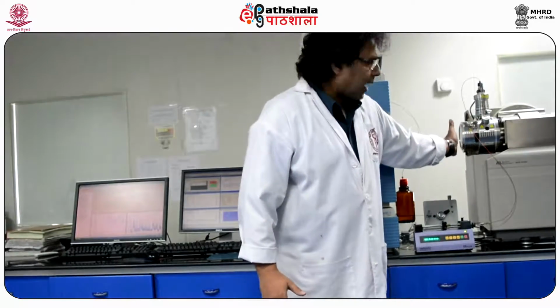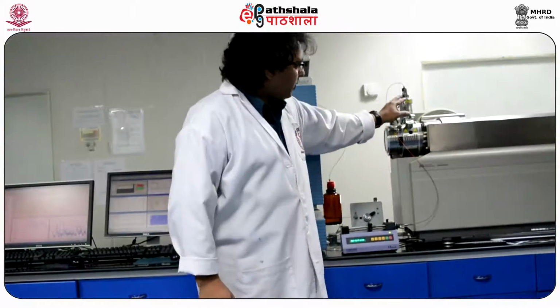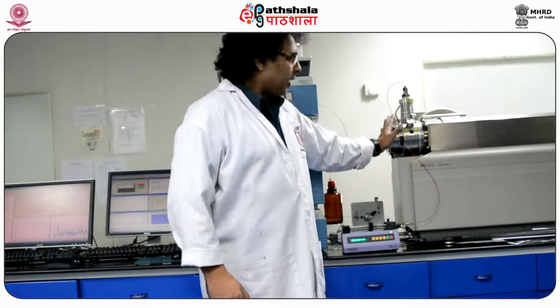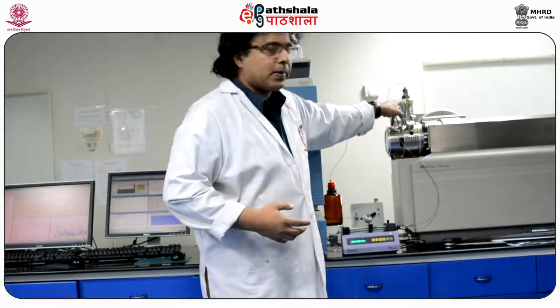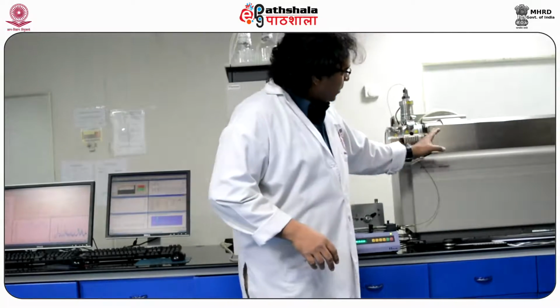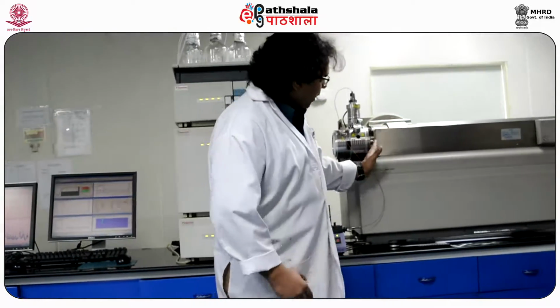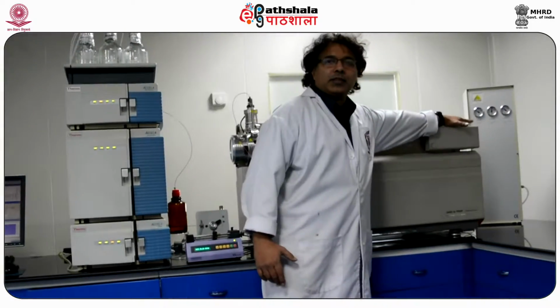What you see here is, as I already explained you, this is an ESI, that is electrospray ionization probe, in which constantly the sample is being fed. Here this is the heater which tries to heat the gases which are coming inside, where the sample is getting nebulized. Here the charge mediated separation happens, and they're focused towards these quadrupoles. Quadrupoles are kept in this range. First quadrupole is here, second quadrupole here, and third quadrupole is here, finally followed by the detector.